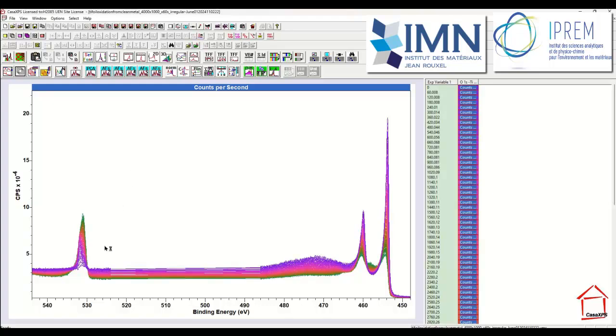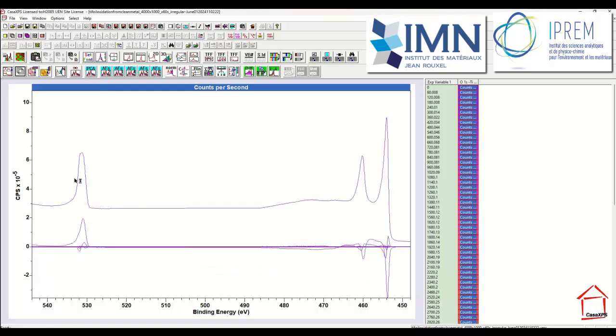We can find out how many different shapes we might expect to see in these data if we simply apply PCA to these data. And then the abstract factors that are calculated are an indication of the signal that's required to reproduce the entire data set.